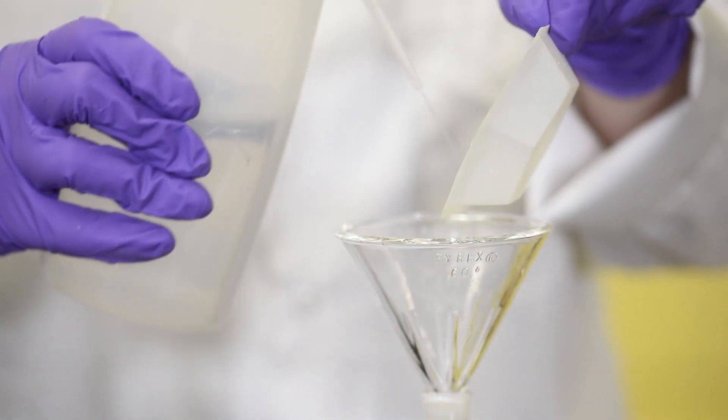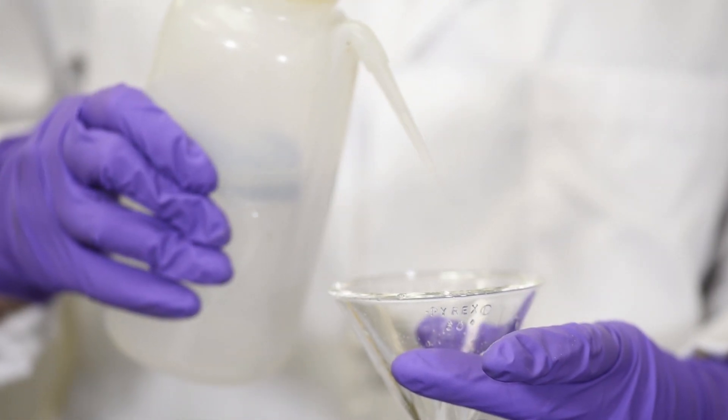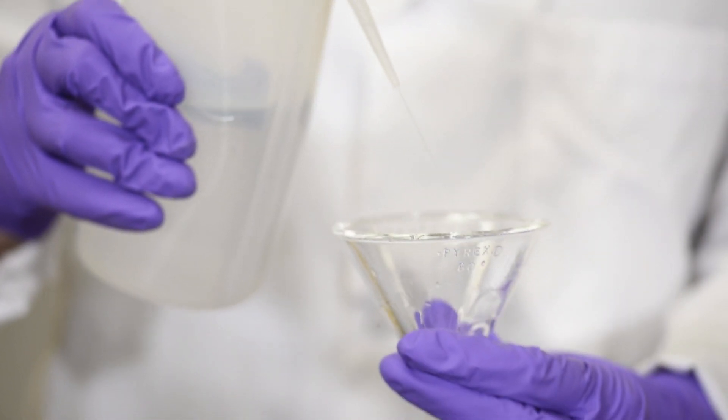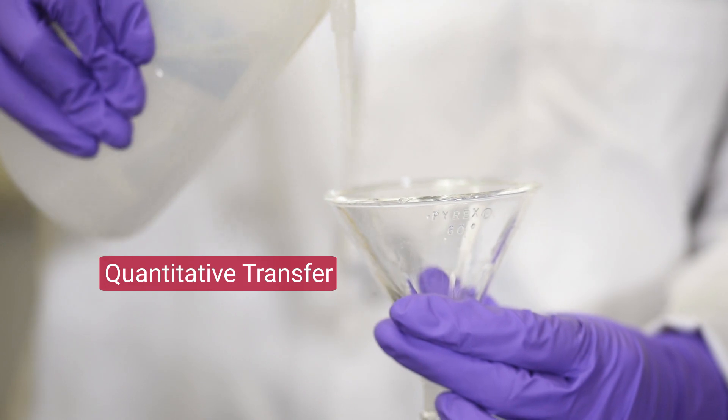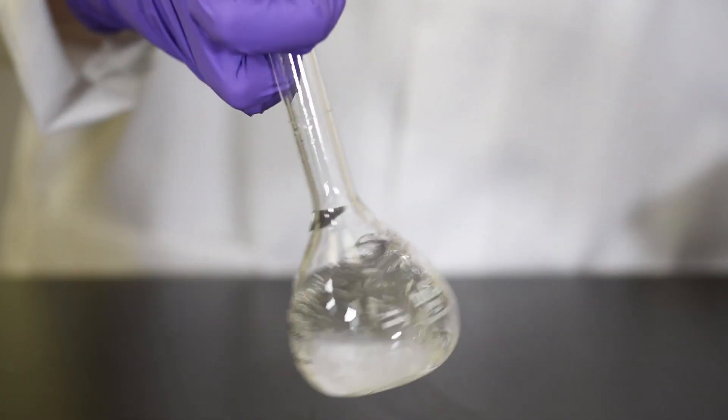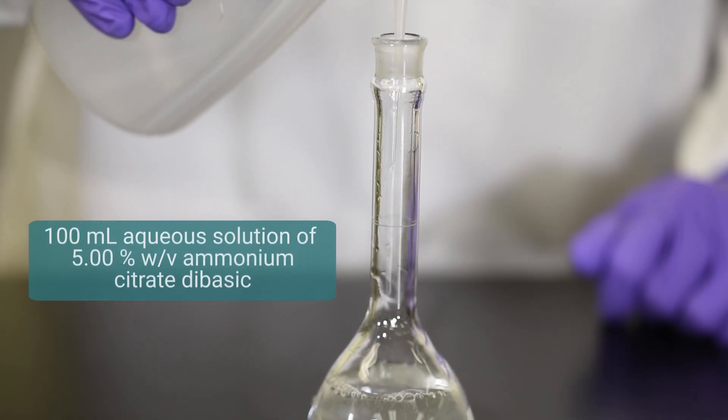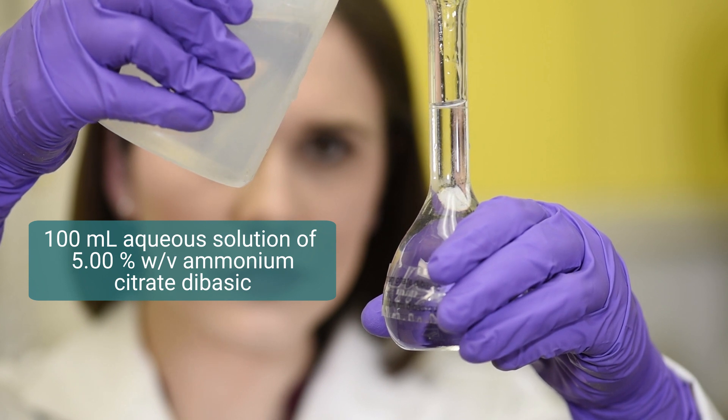I then transfer the ammonium citrate dibasic to the volumetric flask using a clean funnel. Next, I rinse the weigh dish with distilled water into the funnel, and then rinse the funnel with distilled water into the flask. This technique is called a quantitative transfer, which is used to ensure that all the solute ends up in the flask. I cap my flask and swirl the solvent around to dissolve the ammonium citrate dibasic. Finally, once it's all dissolved, I add more water, bringing the bottom of the meniscus level with the fill line on the 100 milliliter flask.